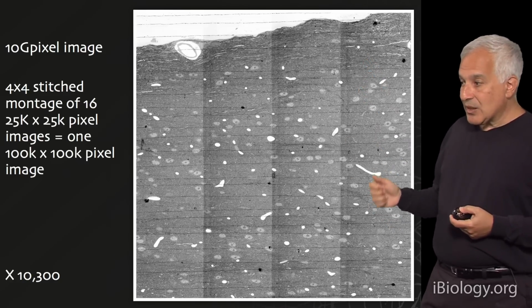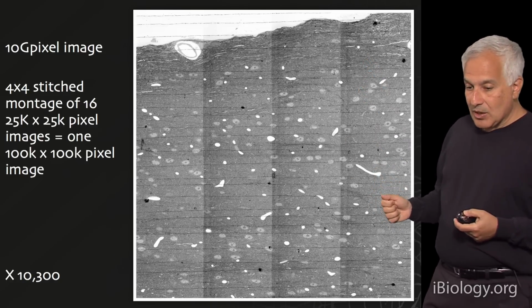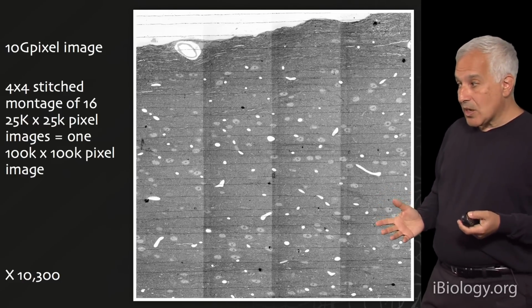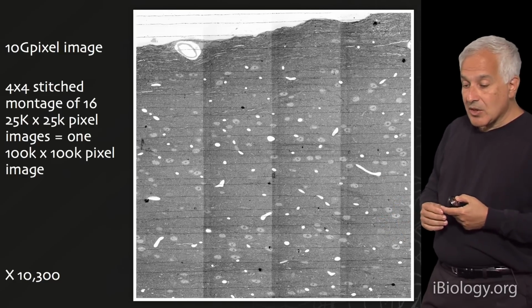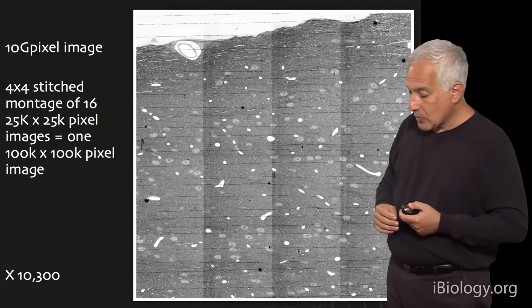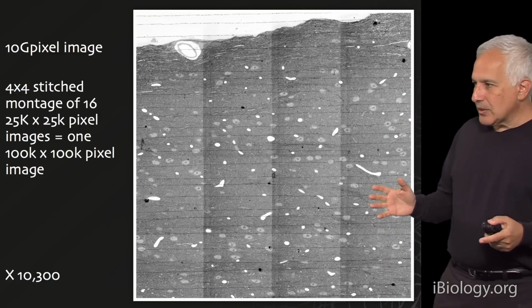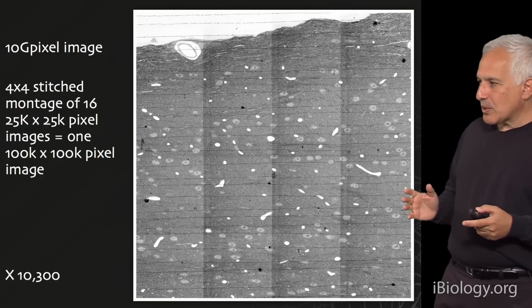That's one image, and then we do that 10,300 times. So a huge data set, and it's about 100 terabytes, and we do about a terabyte per day as we take these images with our present tools. This is a single image. It gives you an impression of how much data there is in one image.